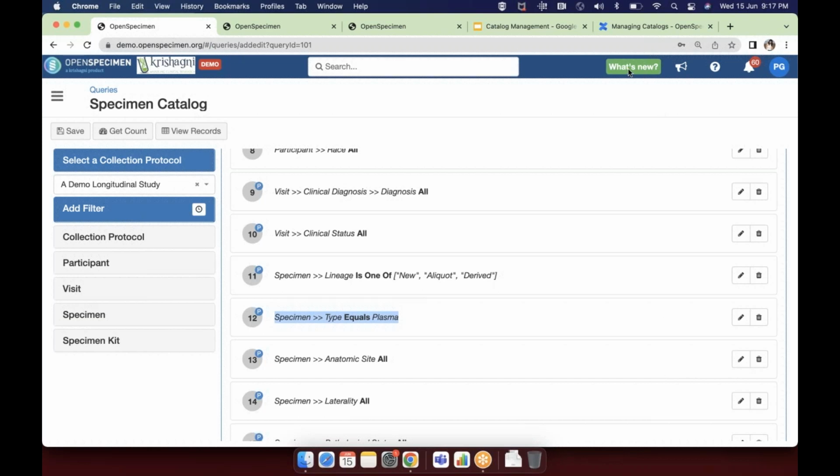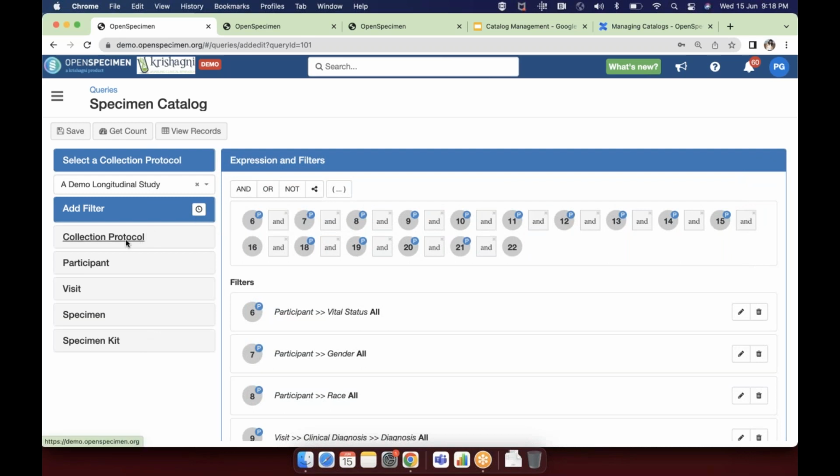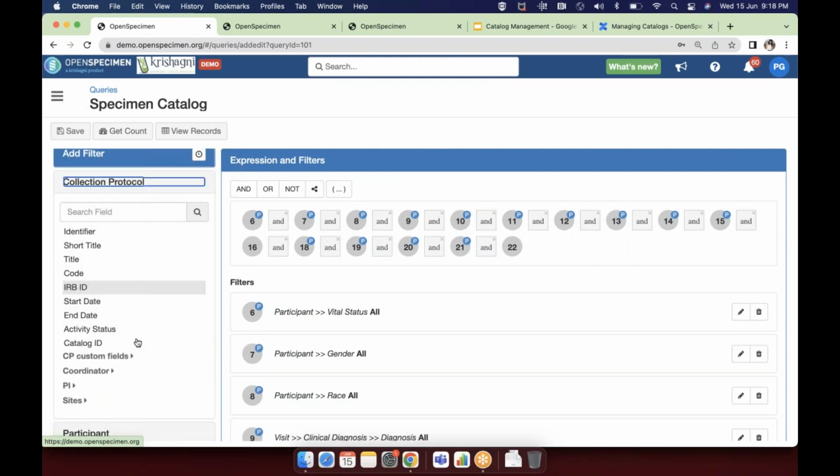Partly. So I'm thinking of, in our biobank, we have people collecting generically, and then we have people collecting specifically for a project that they are doing. And I can imagine them not necessarily wanting those to be available in one single whole biobank catalog. So how would I make a catalog for, say her name is Sue, how would I make all the samples that Sue collected in one catalog, but it's not necessarily just Sue that collects or enters the data?